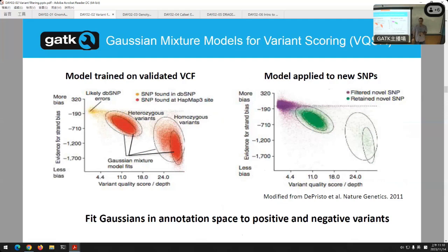All right, I'm going to give you a big hint. Hardy-Weinberg is the hint here. So what is the Hardy-Weinberg theorem? What does it say? That if something is homozygous, it's going to be high frequency. All right, so a homozygous variant will be at high frequency based on genetics. If it's high frequency, it's almost certainly going to be already seen in HapMap or dbSNP. So we would have seen it already. There are very few SNPs we'll see that'll be homozygous that will actually not have already been seen in someone else. And this is meeting our expectations.